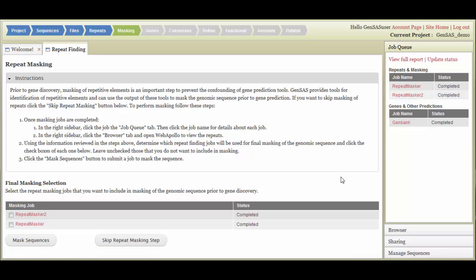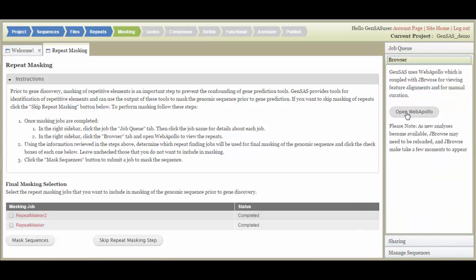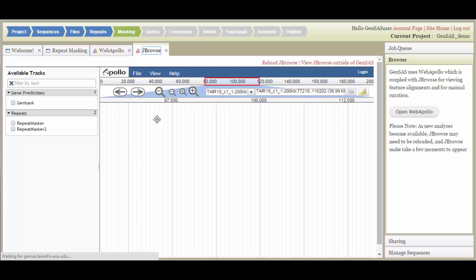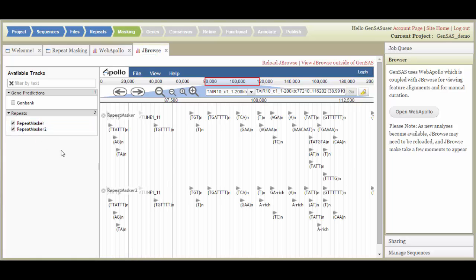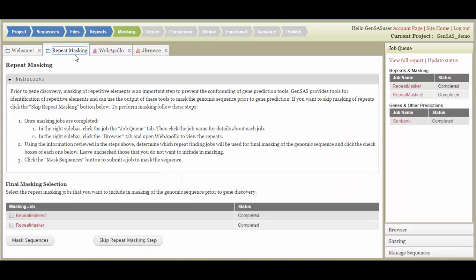You can view the data in multiple ways. You can either view the raw data and the details for the job through the Job Queue like I just showed you, or you can use the integrated JBrowse. To open JBrowse, click on the browser section of the right-hand accordion menu, and then click on the Open Web Apollo button. Two new tabs open, and you will need to select the JBrowse tab to view your data. If the tracks are not visible, click the boxes next to the track names on the left. Once you have looked at the data, decide which data sets will be included in the Masked Consensus, and return to the Repeat Masking tab.